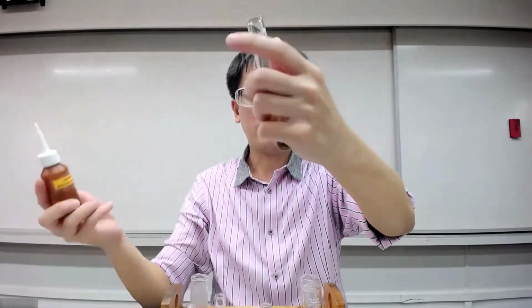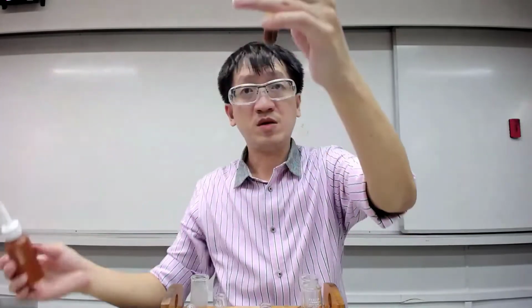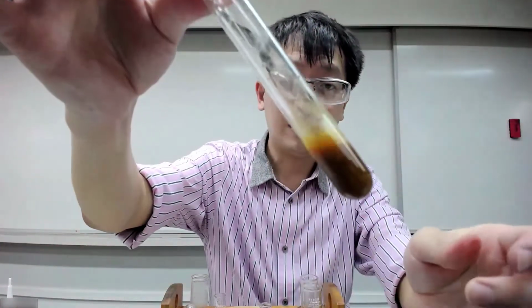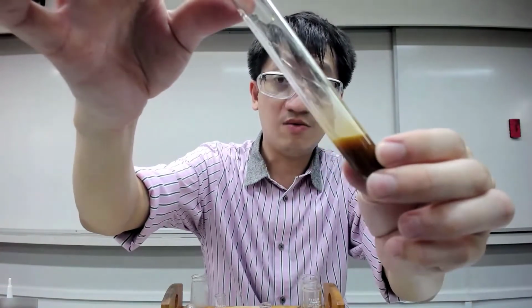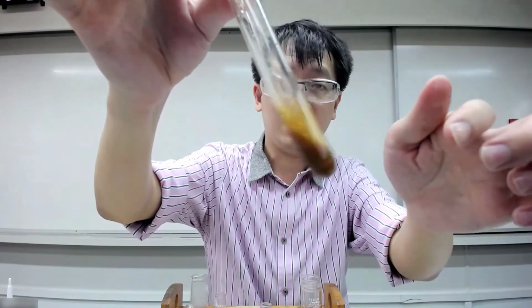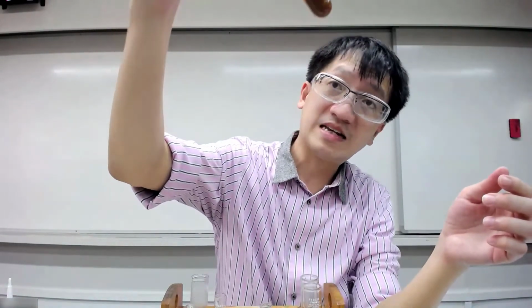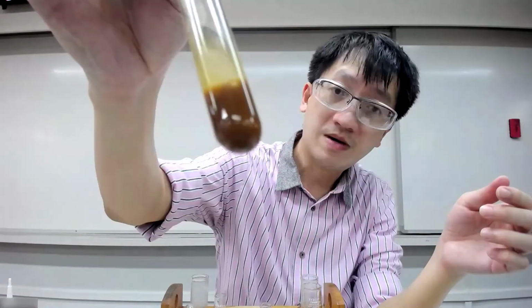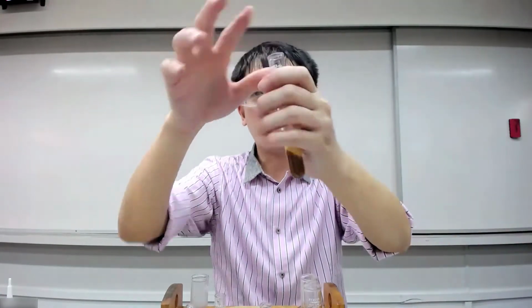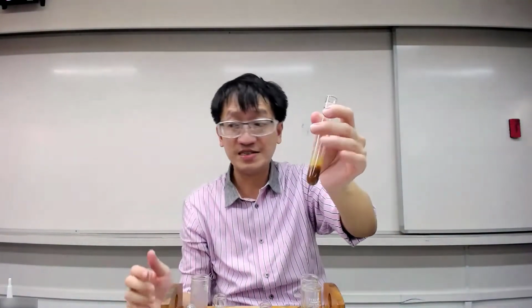If you wish, a little bit more. Now it's very obvious already. Can you see the white powdery thing at the side? If you leave it long enough, you'll see some of the white PPT settling down, but sometimes we don't want to leave it for so long because we need to rush through the lab. So I think a little bit of experience does help.